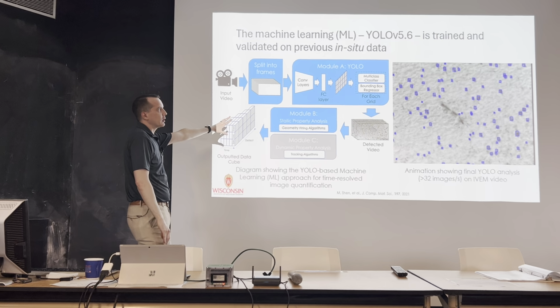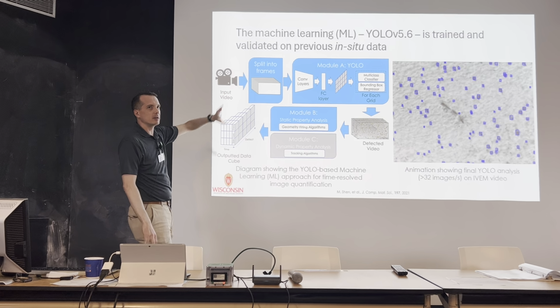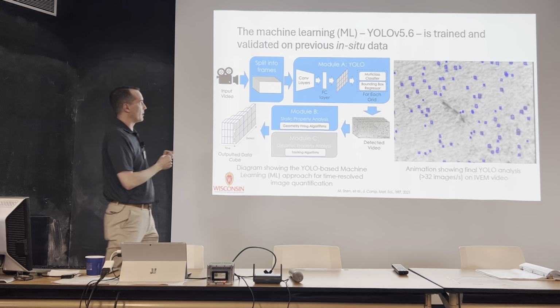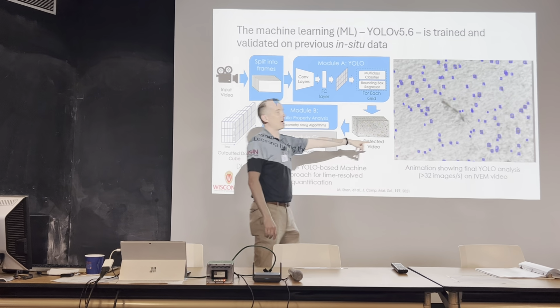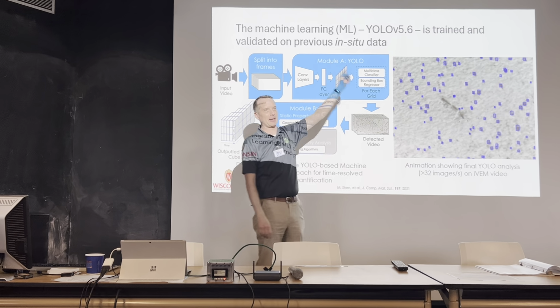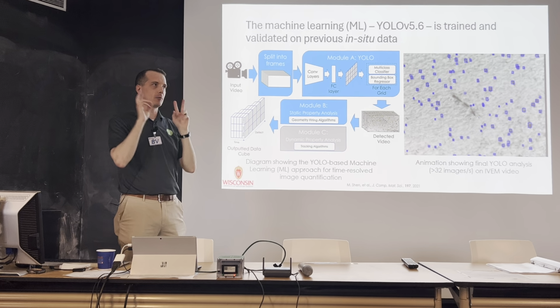So I'm going through this one a little quickly, just because I'm pretty sure everyone kind of knows there's the training stage, there's now the deployment stage, and so on and so forth from that. But this is just showing that, okay, we can do this with in situ data. Now this wasn't, I'm going to say live, this was a video after it of in situ data that they created and then applied it to. So it wasn't at the microscope, it wasn't quote unquote real time.